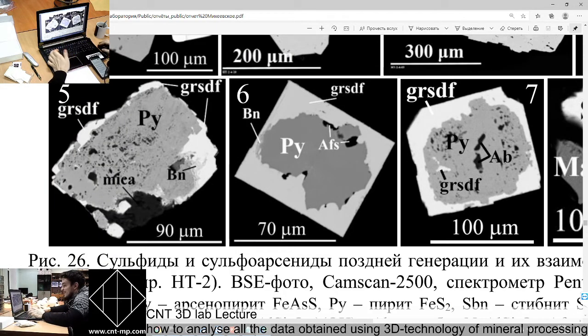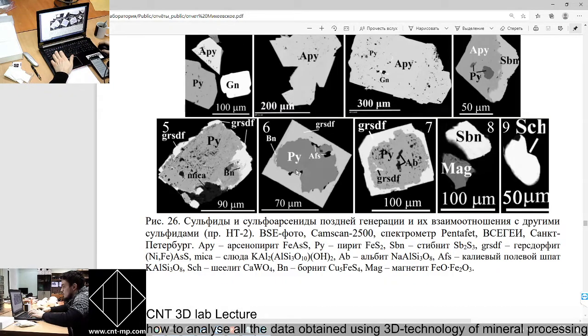And also inside this grain we found another mineral. So this cube is gersdorffite, and in the inner space is pyrite or hudsonite. This is actually a light mineral, and also mineral resource is bornite, a copper bearing mineral.